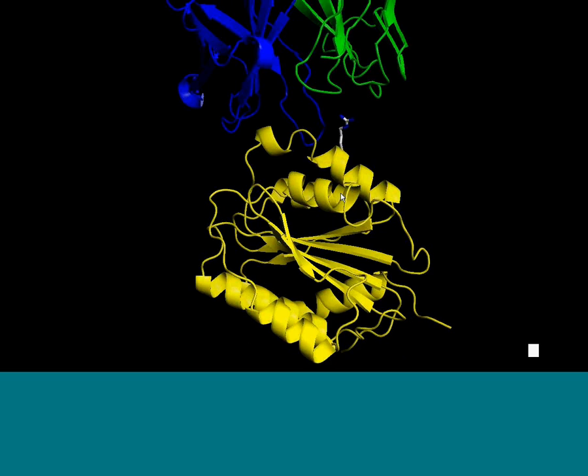Right. Yes, I would have guessed it would have been a more gentle way to go compared to some of the other strategies. I just thought you might have had some quantitative data that would be beneficial to others. But yeah, that several hundred or 100 regenerations is pretty good for those types of capture methods. Yeah, we're kind of surprised actually at how well it worked.